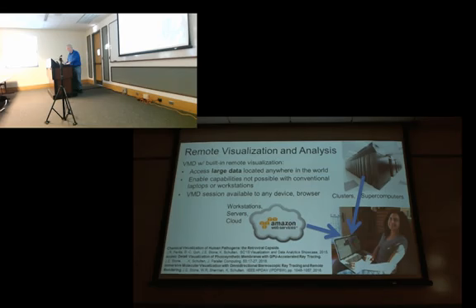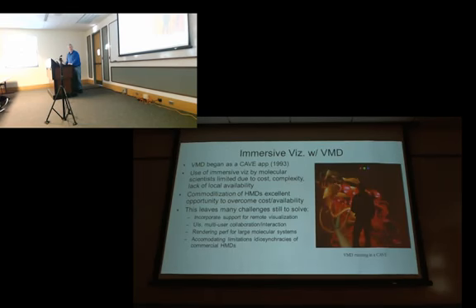Right now we do this with a great commercial tool called DCV, and I'm going to give you a little quick demo before I run out of time. And we'll have a simple version of that built into VMD. And so this is an example.